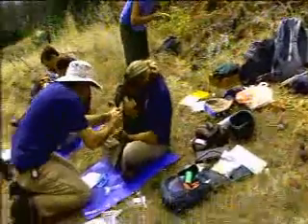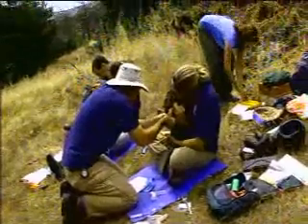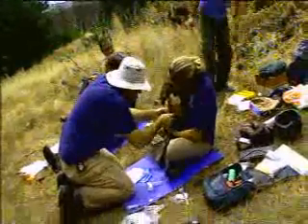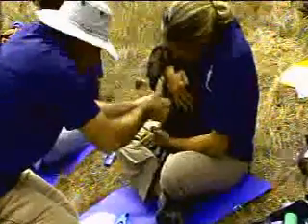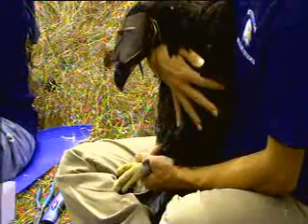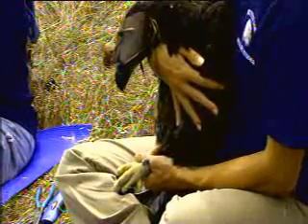The next thing we're going to do is put wing markers on these. Don't forget to get three feathers. We'll just pluck a couple breast feathers for analysis as well.